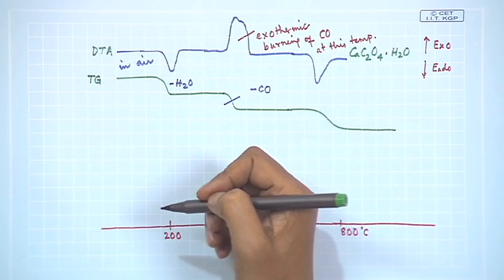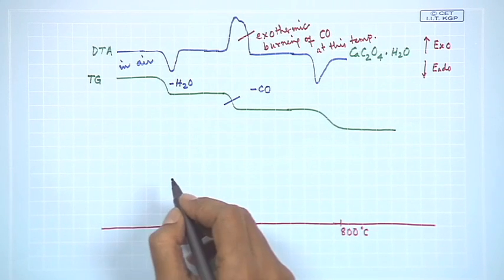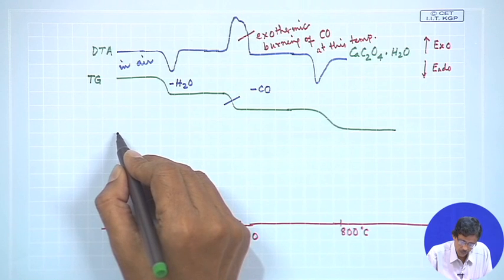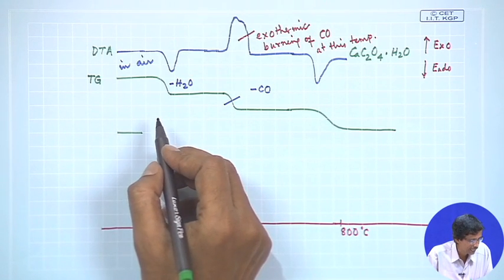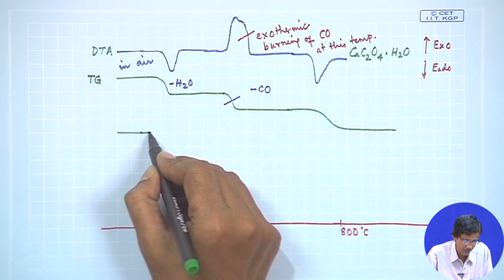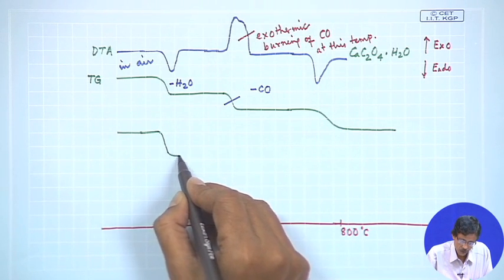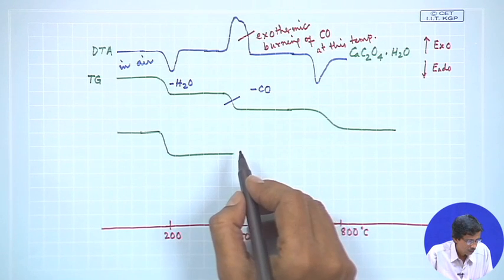So, we will be able to compare it for the next one, that means the corresponding one for what we get in CO2. So, the corresponding plot, because we are looking for the corresponding effect or the change, that means that particular one in CO2 environment, and this water elimination step is more or less the same, but in CO2 environment a certain amount of change you can have.